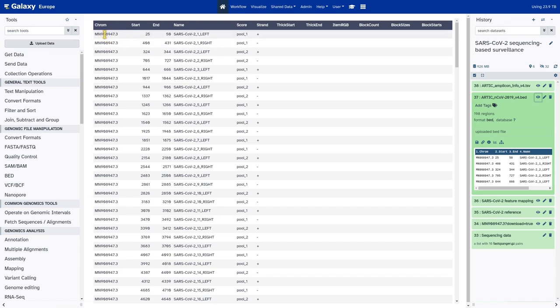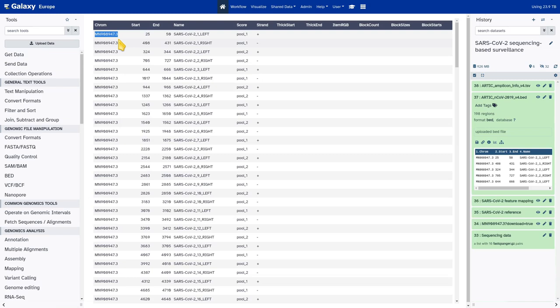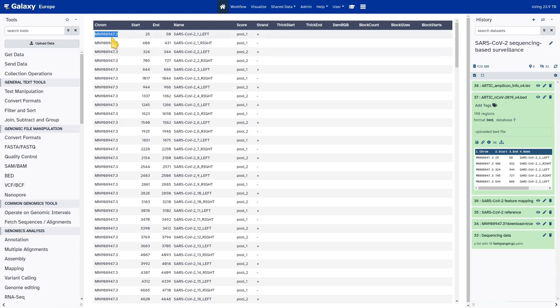Don't worry about the sequence names here — these are INSDC identifiers, specifically the INSDC identifier of the SARS-CoV-2 reference sequence. The tutorial talks about the equivalence of this identifier and the NCBI RefSeq identifier for the primer BED file. It really doesn't matter which one is listed here — the tools we're going to use with this primer BED file will not care about this name as long as there is just one single name in the file.